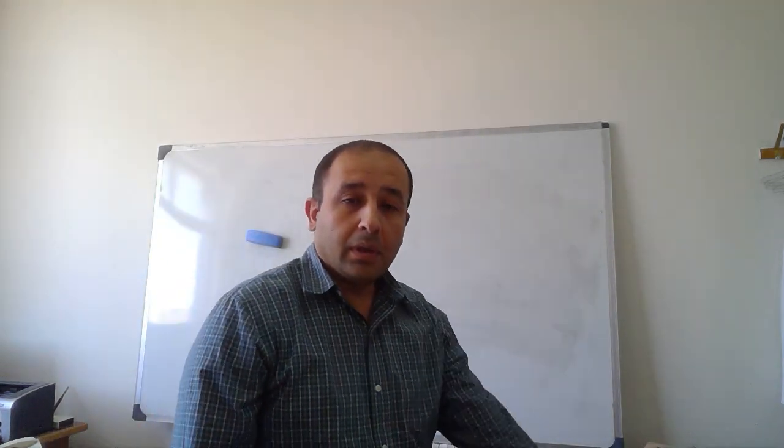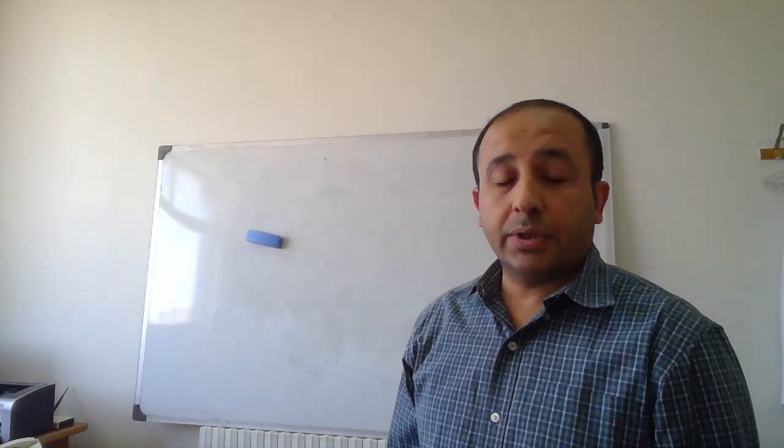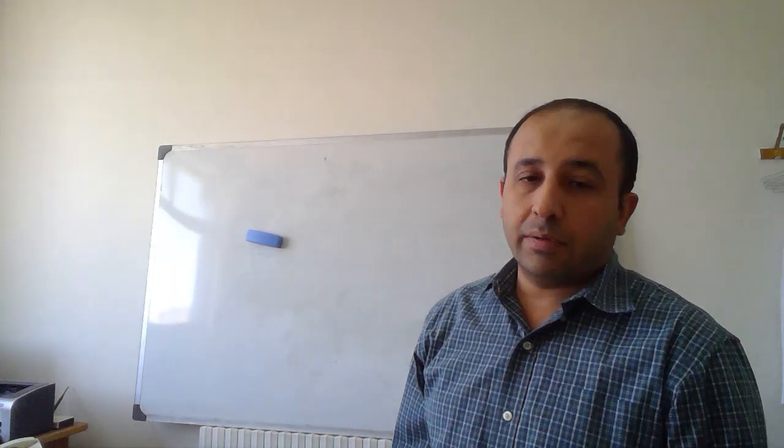Good afternoon, dear students. Today we will take some examples to illustrate the concepts of chromatographic separation mechanisms. If you remember, we covered the main mechanisms, namely size exclusion, partitioning, and adsorption. And we shouldn't forget the ion exchange mechanism, either cation exchange or anion exchange.